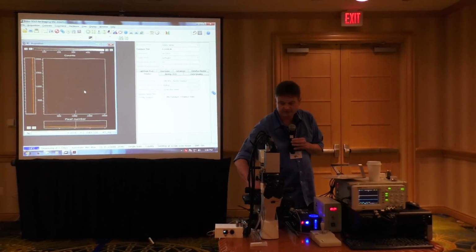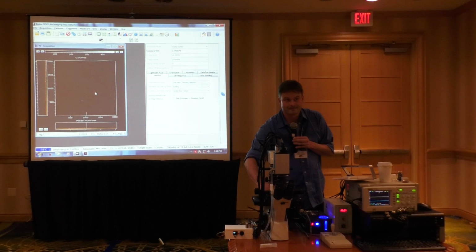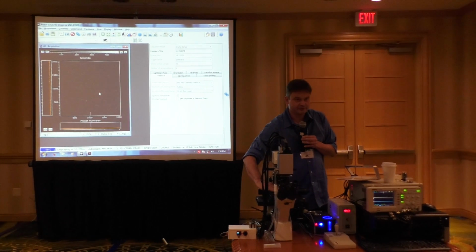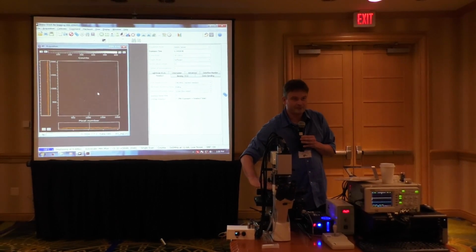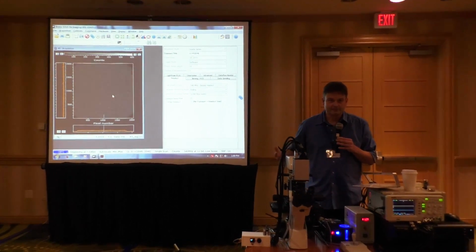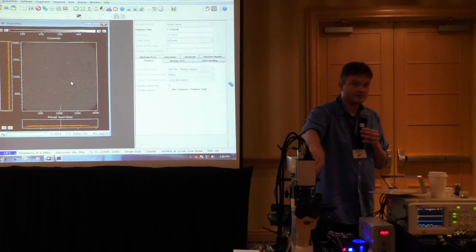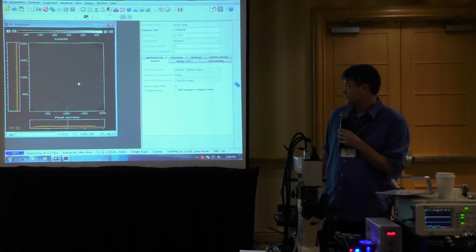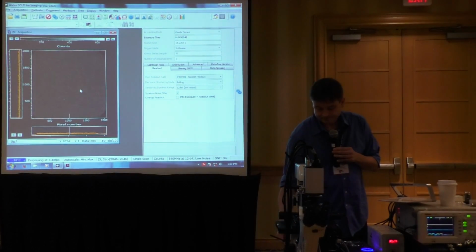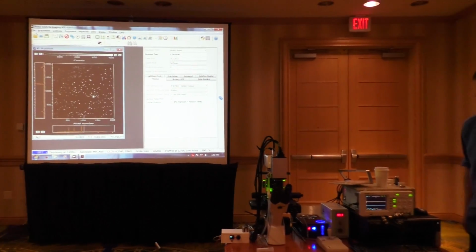Now, we're a little unfair here, right? If I just make this a little darker, my big picture looks better because I get some room light out with my hand. Now, this is variability. This is part of where my microscope is located, what the room is like. We don't write that into metadata, right? Interestingly enough, the camera that records the image sees the difference very clearly. So photons, in that sense, must be a quantity that is important to us.